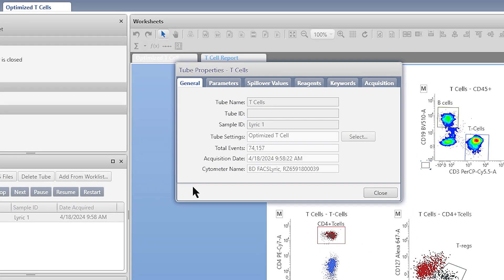When you create an assay, all the required settings to achieve consistent results on a different instrument are part of the assay. For example, spillover values, acquisition criteria, gates, and plots are all saved.